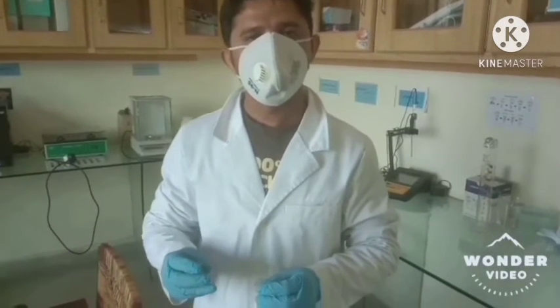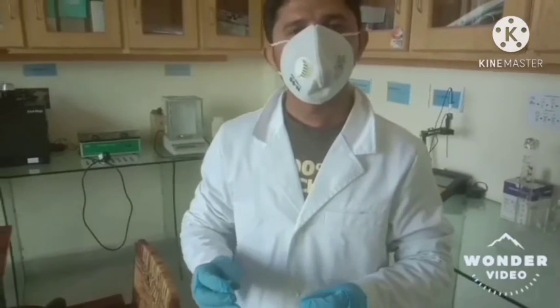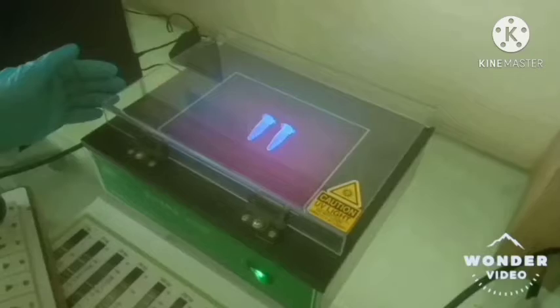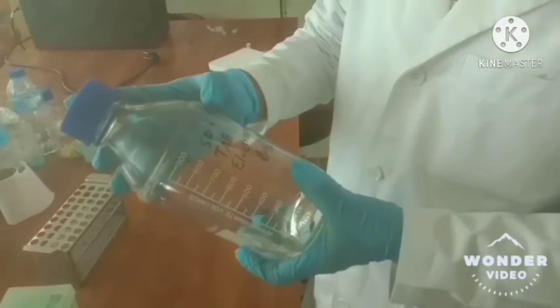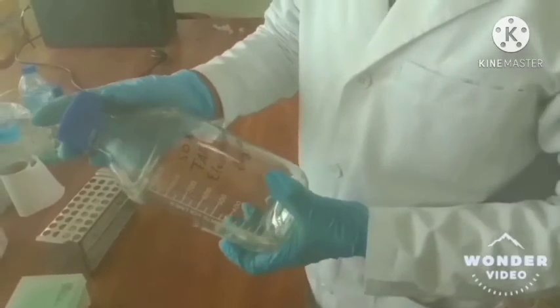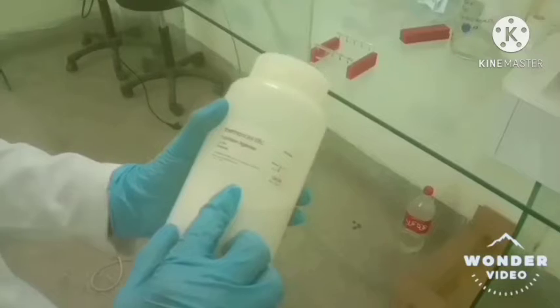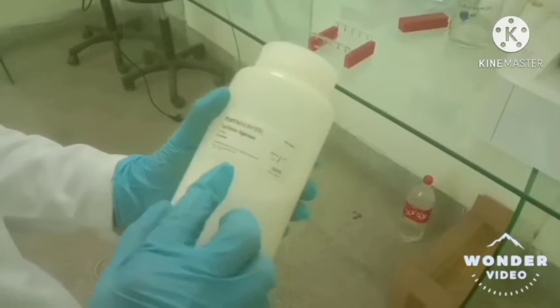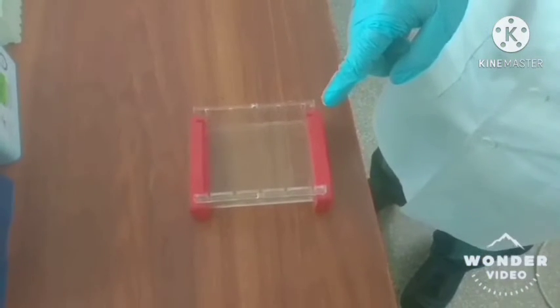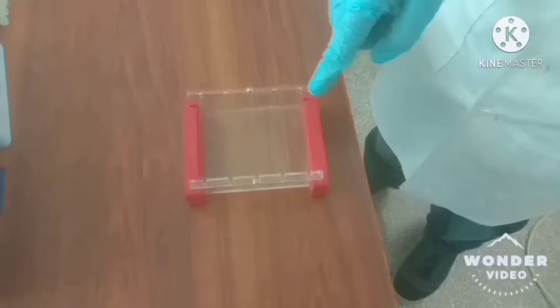We will prepare a 2% agarose gel for running the ladder. The results can be visualized by the UV light system. We will convert 50X TAE into 1X TAE electrophoresis buffer and use the 2% gel for running the DNA as well as the ladder. Using the smart tank, we will take 1 gram of agarose and 50 milliliters of TAE buffer. After heating, we will add 0.5 microliters of ethidium bromide, place it into the tank, and allow the gel to solidify.